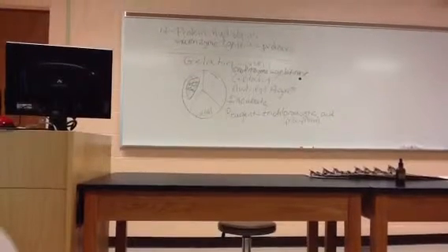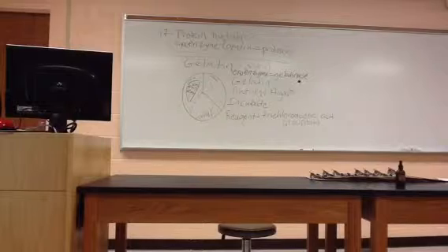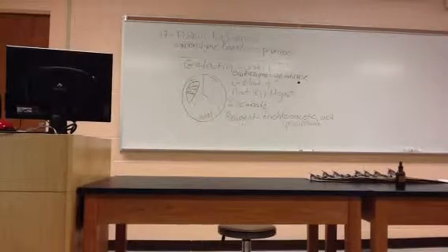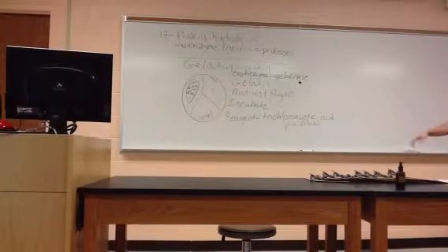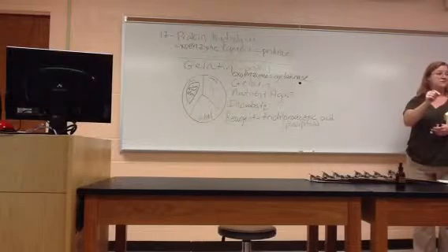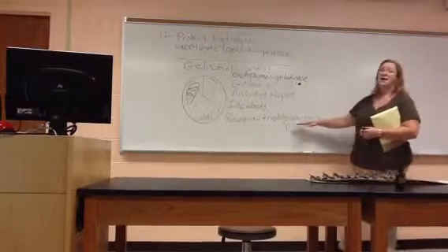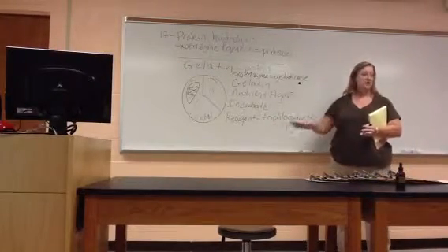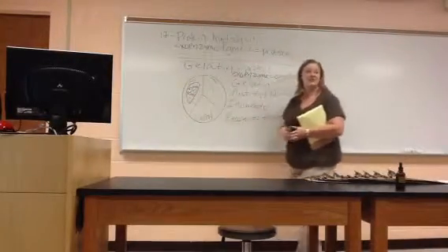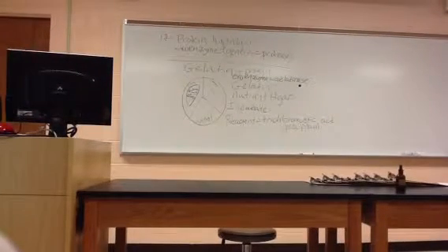Now I will caution you with this, and I'll remind you again when we actually look at them on Wednesday. The bacteria themselves have protein all in their cell membrane and cell wall. They're covered in protein. So when we add trichloroacetic acid, that little strip of bacteria that you can see is going to turn white because the proteins on their surface are going to clump up. So it's not the color of the bacteria themselves. They're all going to turn white. It's the agar around them that we're interested in. Okay, so pay attention to that. That's why I said around the growth, not the bacteria themselves. All the bacteria are going to turn white.